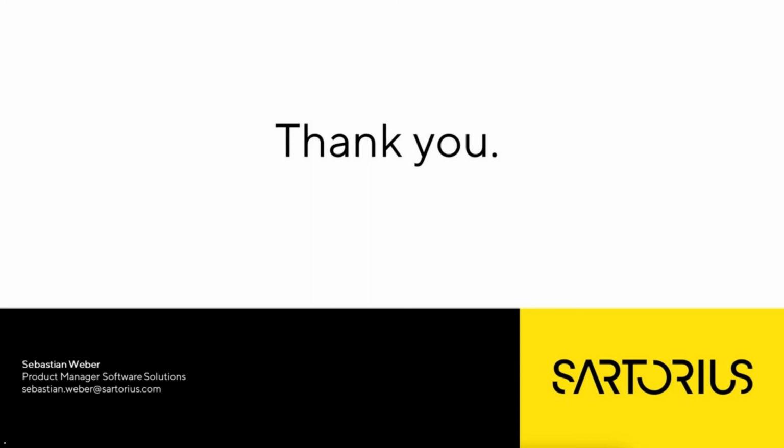So just to highlight, these technical controls that I've listed are all very much part of the whole 21 CFR compliance requirements to give you the ALCOA principle data, but they're all on the balance. It's quite a powerful system, and it's been very, very well received. I'm hoping I've covered everything on that. If there's any qualification needed, please feel free to put another question in the box.